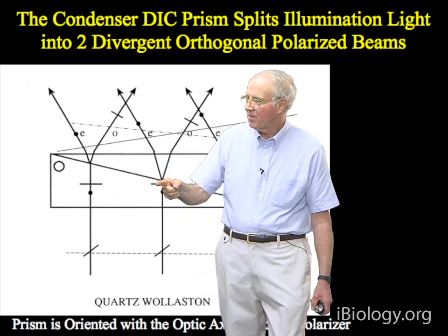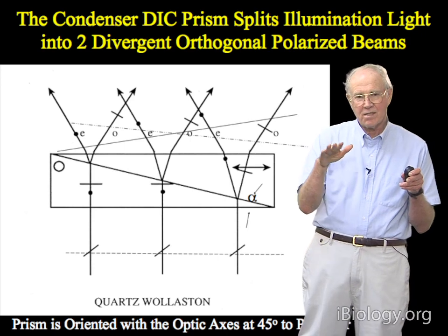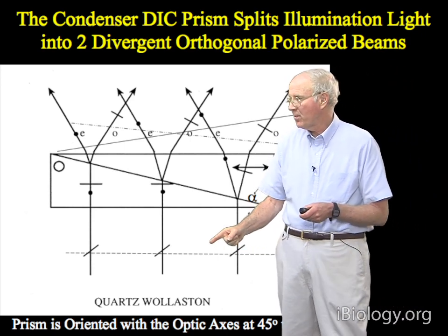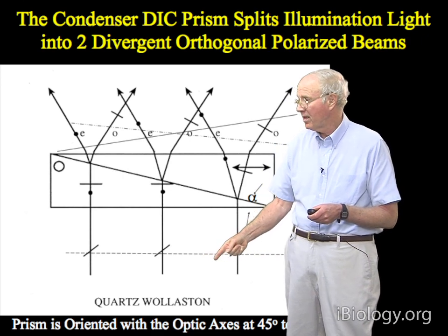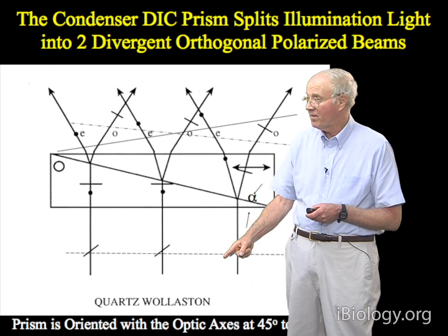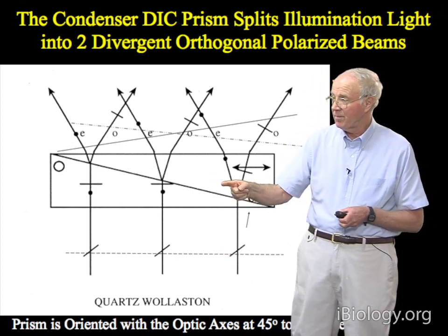And these prisms in the microscope are inserted into the microscope at 45, with their axes at 45 degrees to the polarizer direction. So in this drawing, I've put the polarized light coming from the polarizer here at 45 degrees to the direction of these vibration axes in the crystal.